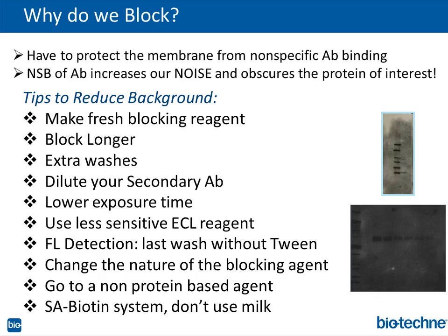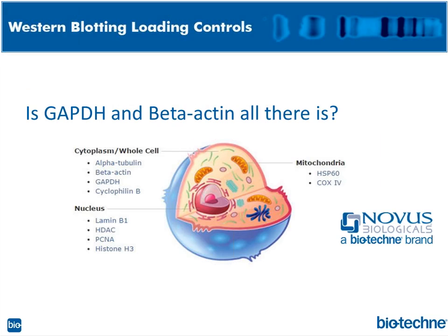Okay. I'd like to just quickly address here, and we're slightly behind on our time, so I want to keep moving along. Loading controls. By the way, I went on Novus Biologicals' website, which I think is a really great site, and I'm not saying it because I come from Bio-Techne, but it's really content rich. Not only does it have a great search engine, but it's got a lot of useful information, and I saw a whole section on loading controls. I thought it was wonderful.